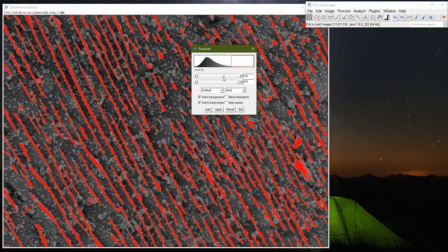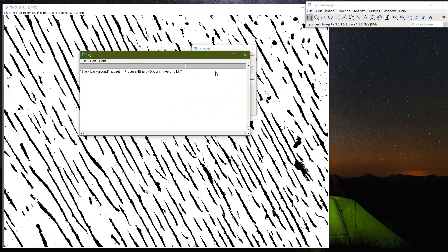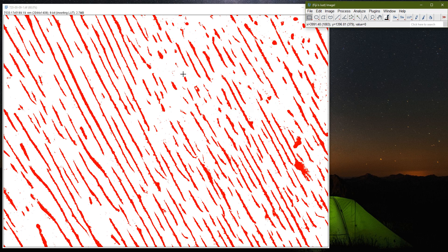I will lower the threshold a little to make sure I am selecting all the adequate features while filtering out the inadequate ones. Most of the lamella — their thickness — seems to be captured at this threshold. When I press Apply, it adjusts the threshold and I can close the dialog.